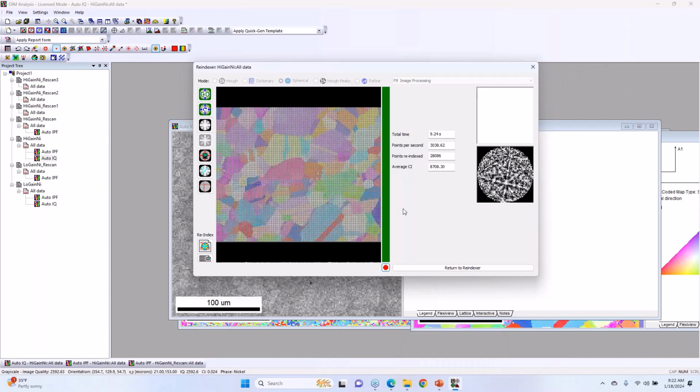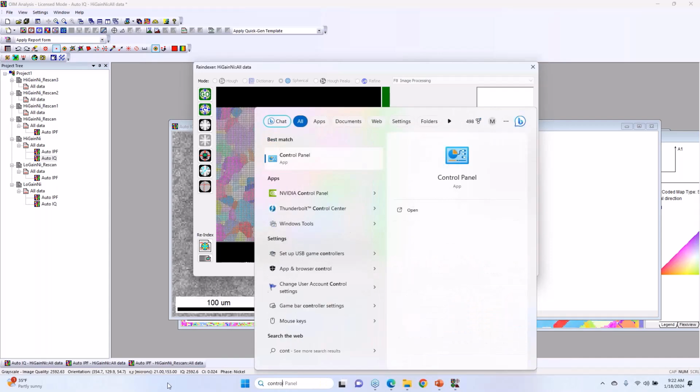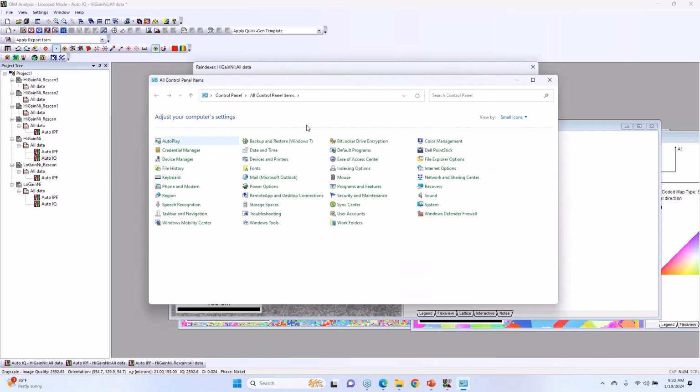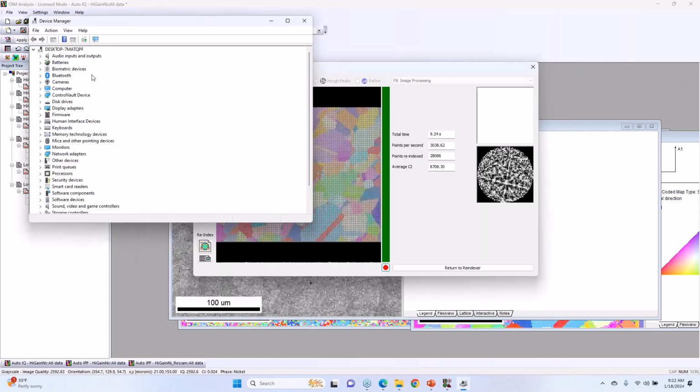So the question is, what GPU do I have? I looked it up this morning to try to remember, and I forgot still, Stephen, but I did try. It's a Quadro RTX 3000, and it had a benchmark of about 7,500, compared to the system that we generally aim to put on our detector, which has a benchmark close to about 20,000.